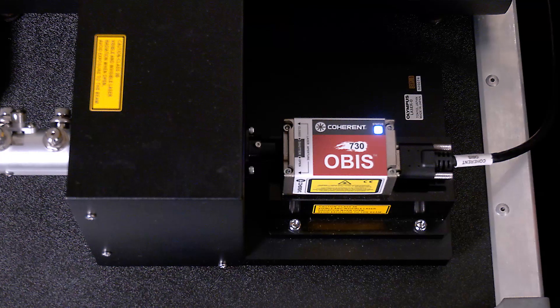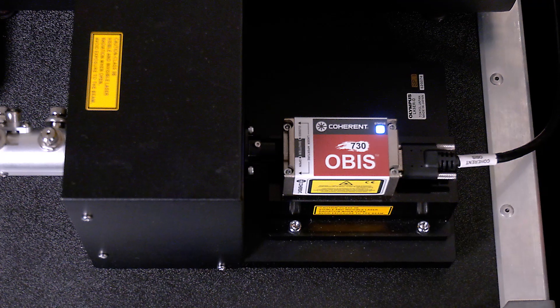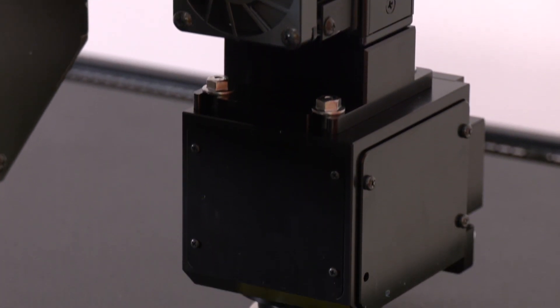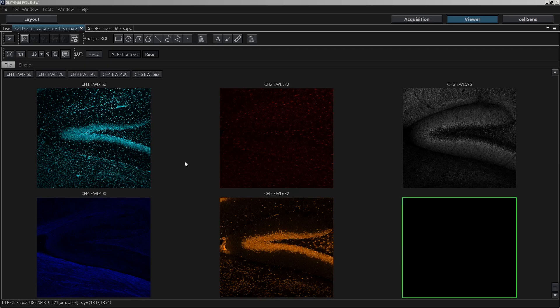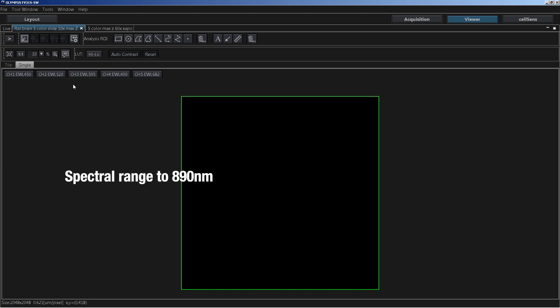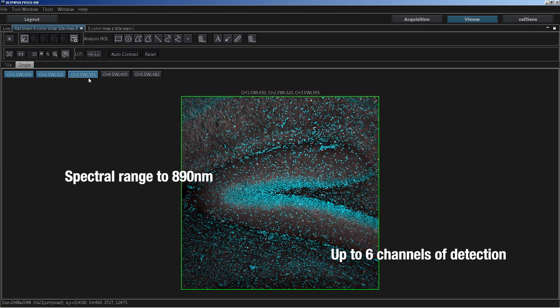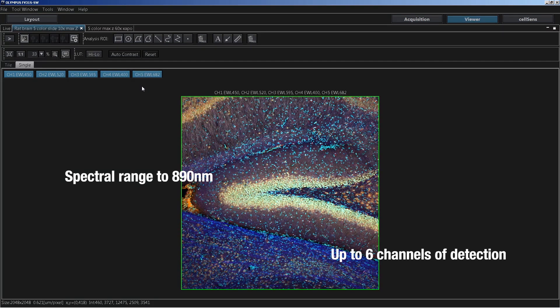The FE3000 RED system overcomes these issues by using near-infrared light to improve the performance of a confocal microscope. First, the system enhances your capabilities for image multiplexing. It expands the spectral range to 890 nm and offers up to 6 channels of detection. This significantly increases your multiplexing potential and the amount of information that you can extract from one experiment.